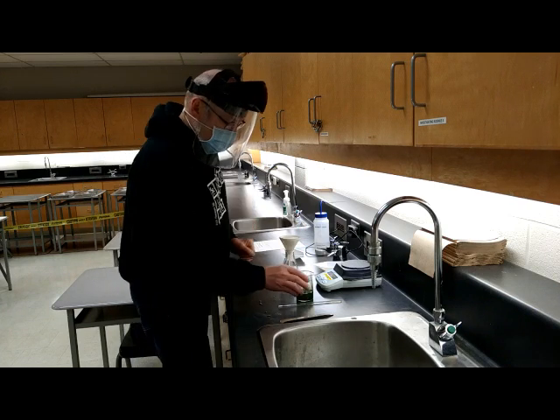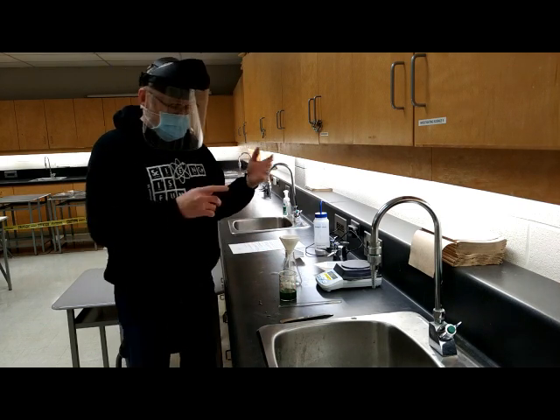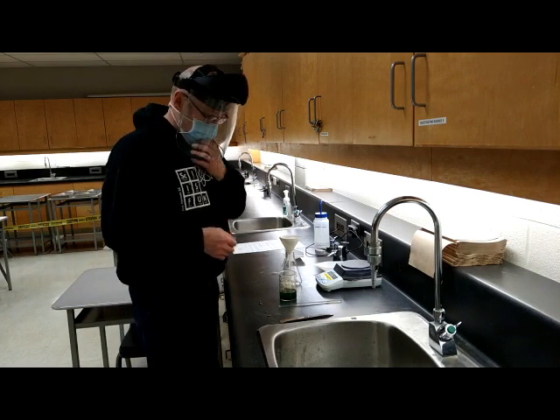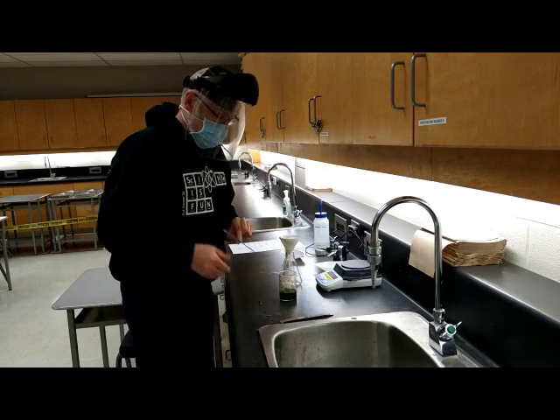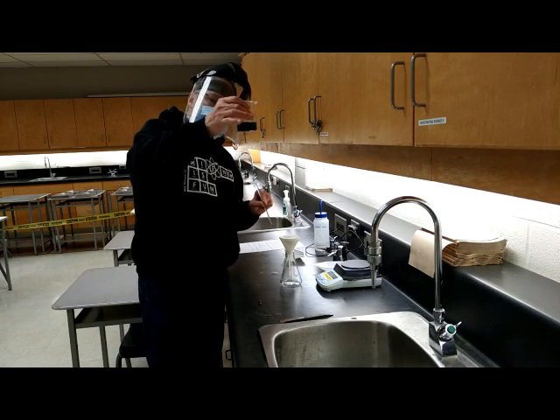All right, so the next thing we're going to do, there's 2 methods of separating the solid from the liquid. You can either decant or you can filter, and actually we're going to do both just so that you've seen them. The first one is decanting, and for decanting what you do is you let the solid precipitate settle out to the bottom.